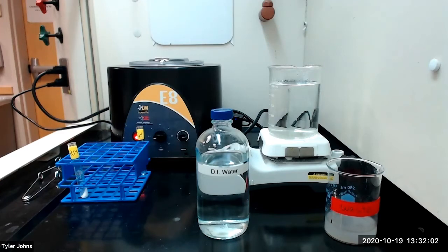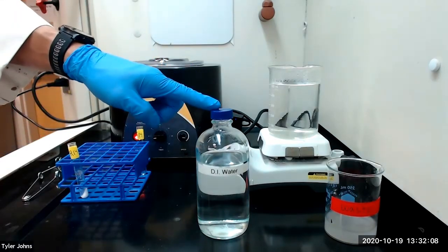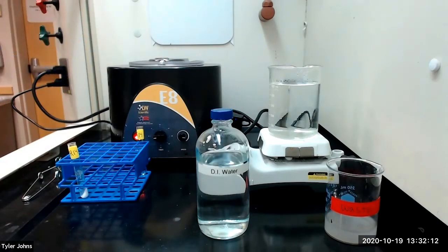We will now perform the test for barium ion. We will begin by washing residue R14 with one milliliter of deionized water, then centrifuging and discarding the wash liquid.